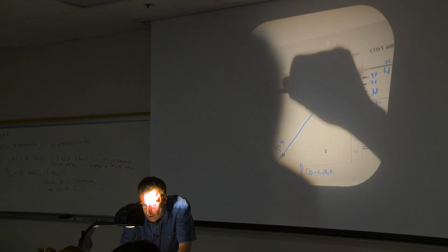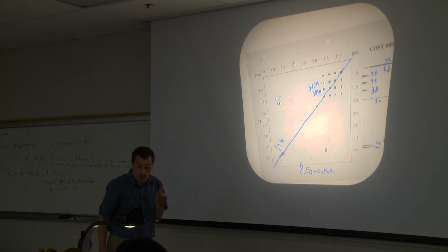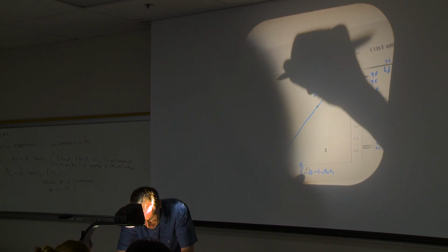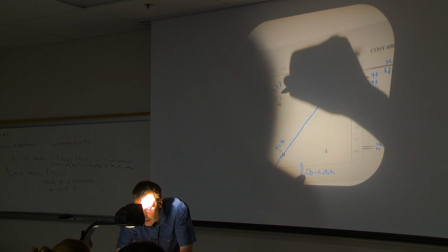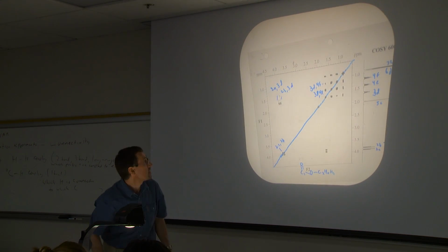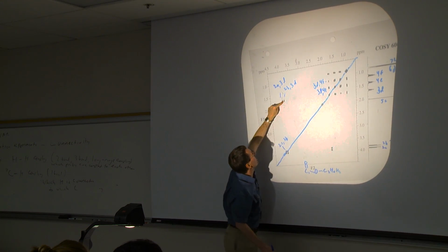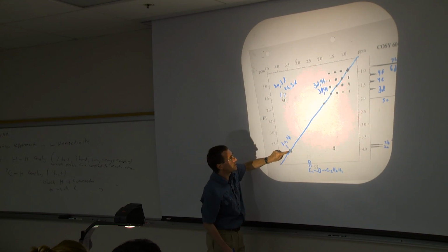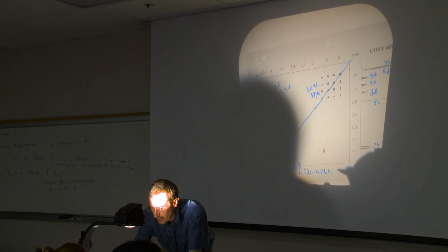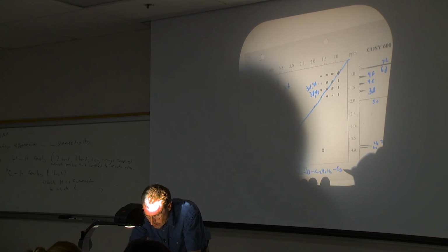Okay, so we've got 2 more cross peaks I want to dispatch with up here. Those are interesting. 2A crosses 3D, and 2B crosses 3D. Okay, so that's starting to build. In other words, we're coming out from here. 3D is crossing with 2A and 2B, right? They're crossing over there. So that is starting to build up our connectivity, C3HD.